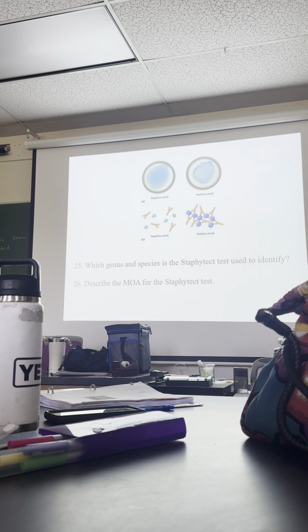I will not ask you about the coagulase test because we don't use it here, right? This is so much better than coag. If you take this course at one of the other campuses, they use coag. Okay? We moved away from it.